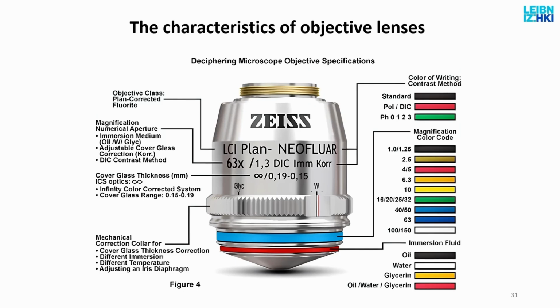Okay, so this is that. And this is what we just talked about, this range. In biology, naturally, you have a microscope slide with your sample on it, and a cover slip. A cover slip will shift the light. It will not bend it, as you remember, it shifts it. Now, you remember also that if I shift the light off the optical axis, I will get spherical aberration. My lens is corrected for spherical aberration, but it needs to know how much glass there is in between.